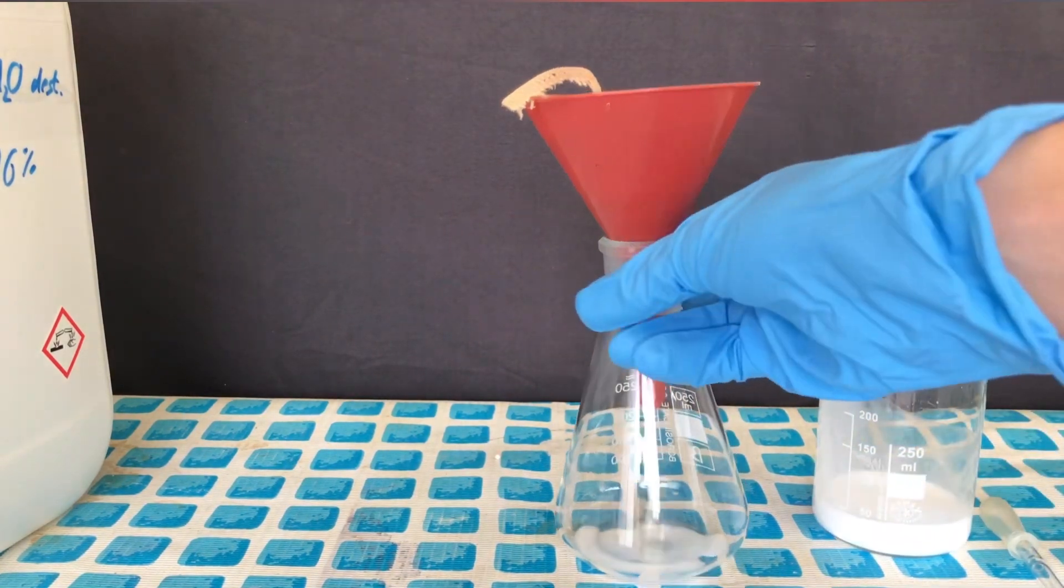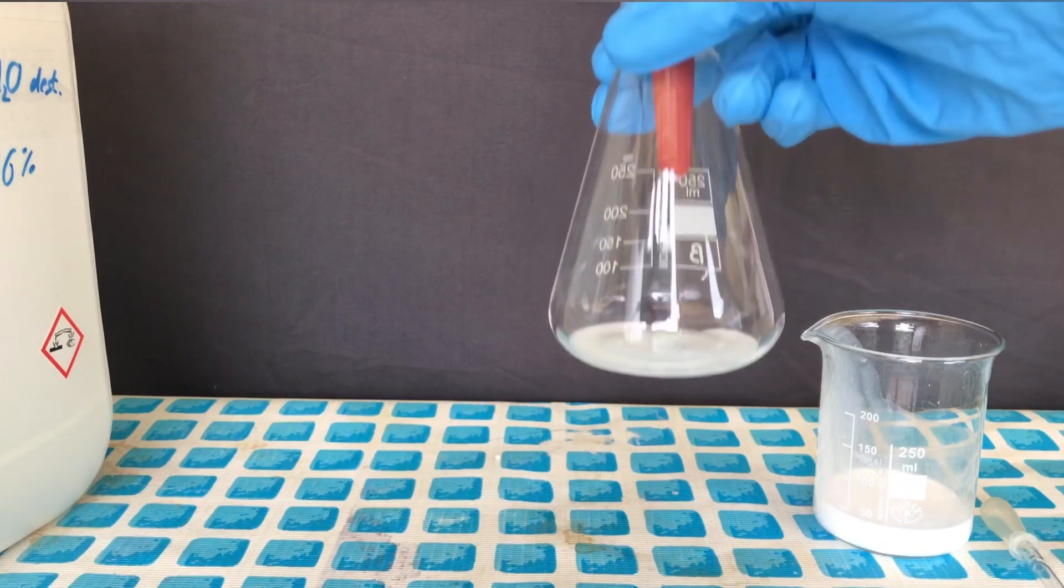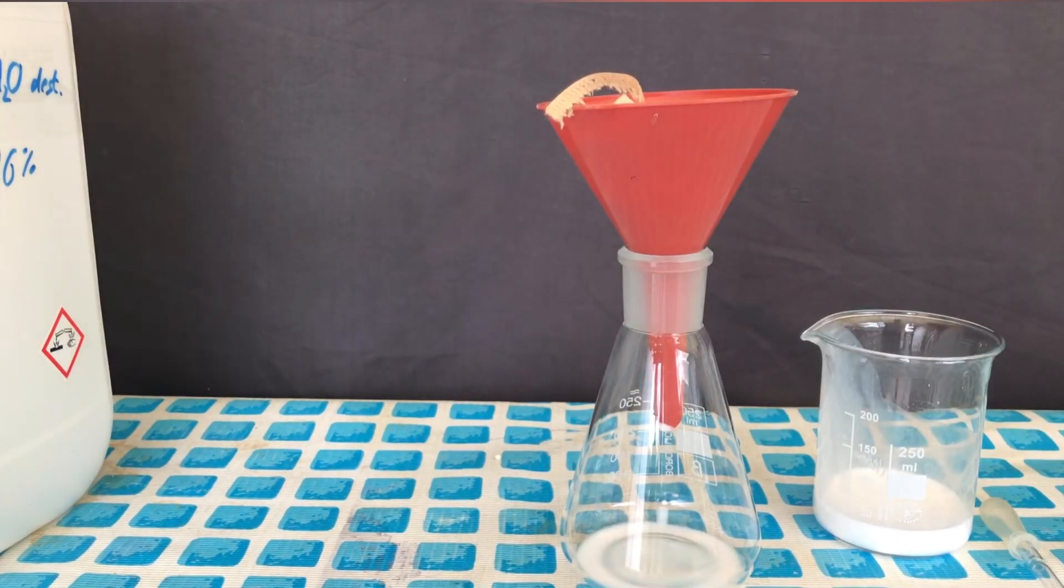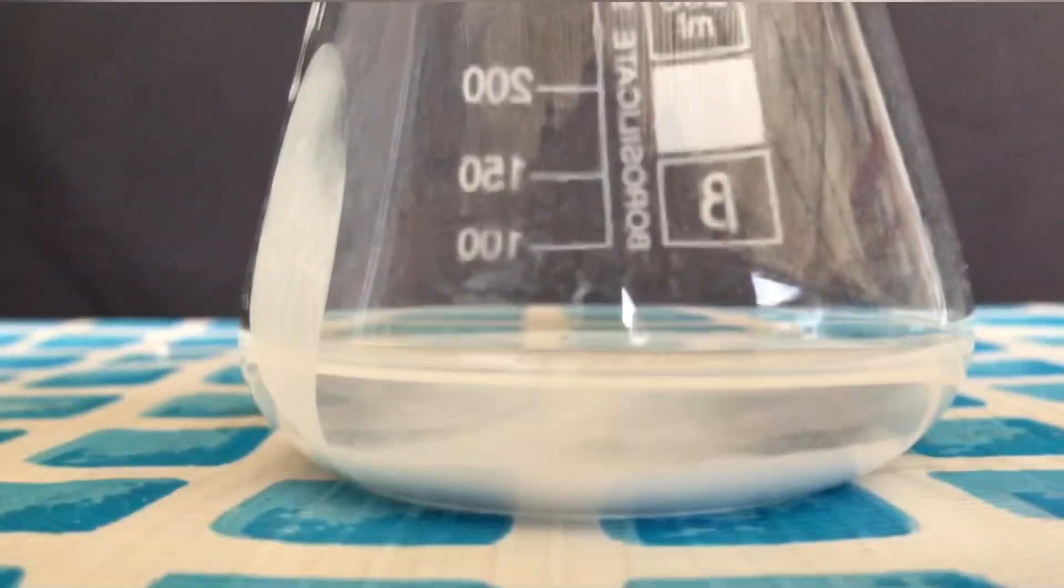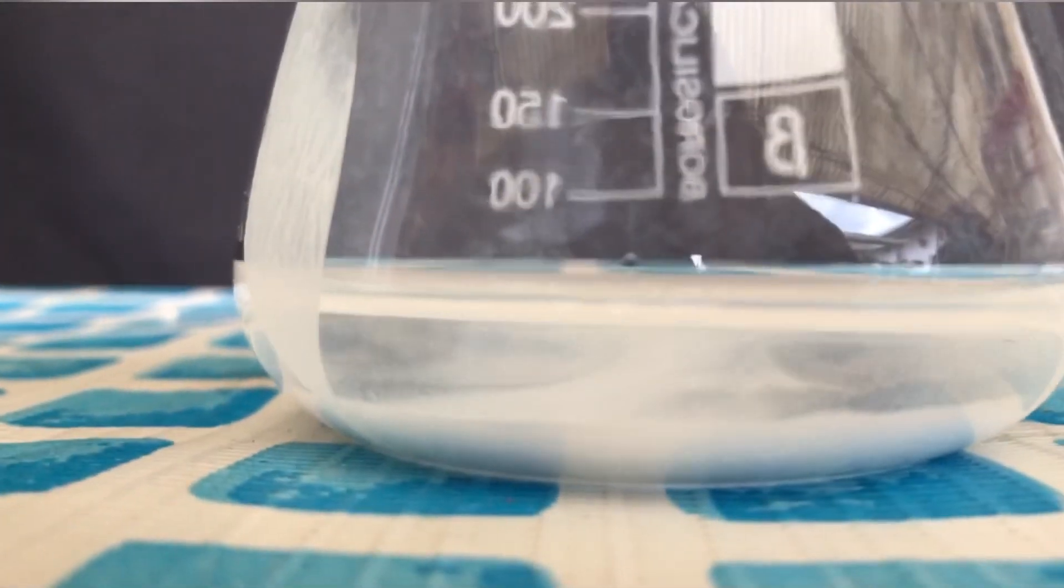We tried to get rid of the barium sulfate by performing a gravity filtration, but as you can see, it passed right through the filter. Fortunately, the barium sulfate collected at the bottom of the Erlenmeyer flask.